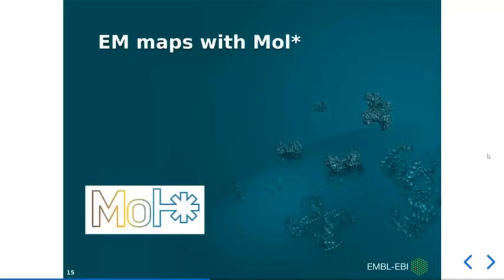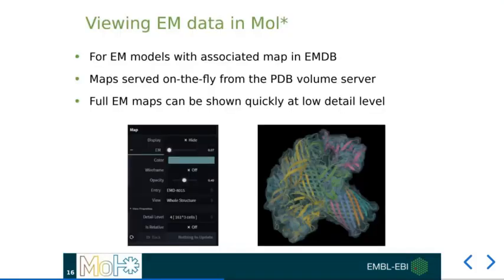Okay, moving on. In this section, I'll show how we can start to analyze EM map data. Historically speaking, visualizing EM data has required quite large data transfers. Other tools, for example, would previously ask you to download the map files to your local machine. However, with Mol*, any EM entry with an associated map can be quickly visualized totally online.